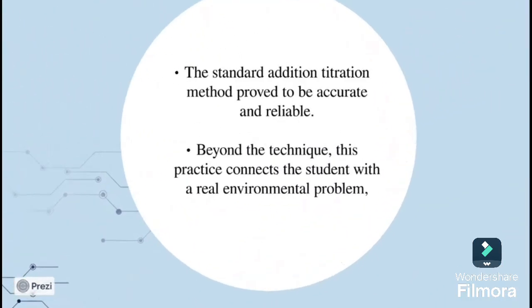Conclusions. 1. The standard addition titration method proved to be reliable. The results obtained were very close to the calculated values, which validates its use as a helpful technique to measure the acidity of rainfall. 2. Beyond techniques, the practice connects students with real environmental problems, turning the subject of acid rain from theoretical material into a meaningful experience that fosters environmental awareness.